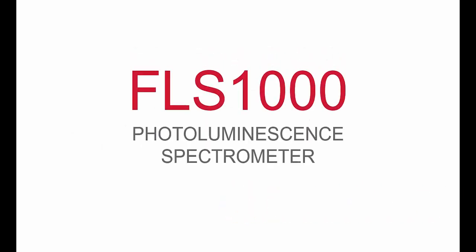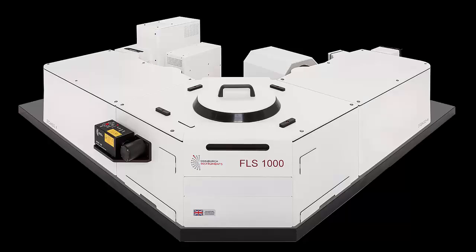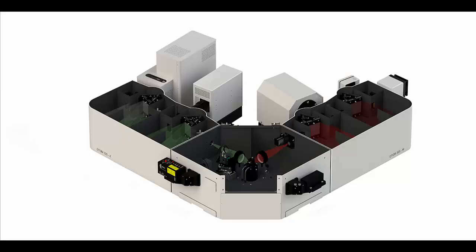Welcome to the FLS1000 Video Tutorial 1, Introduction and Steady State Photoluminescence Measurements. The FLS1000 spectrometer is designed as a complete modular spectrometer.